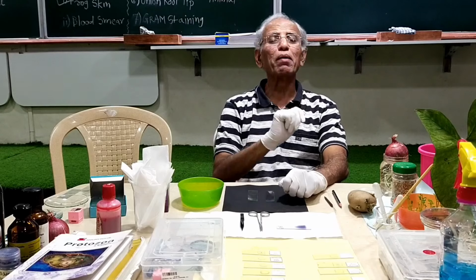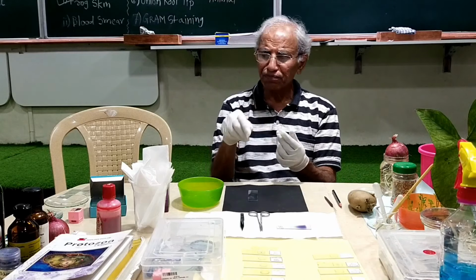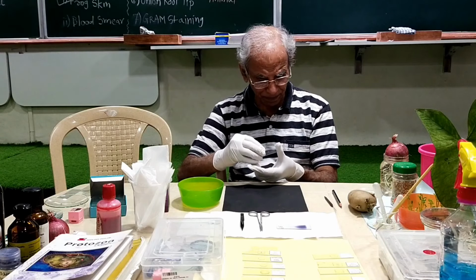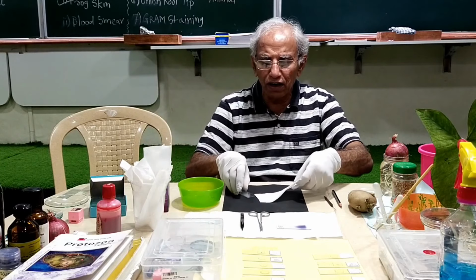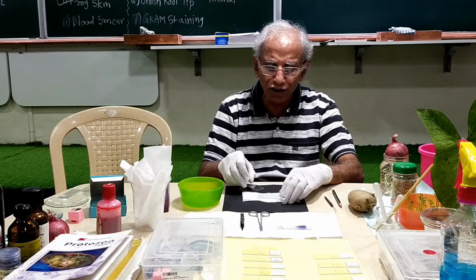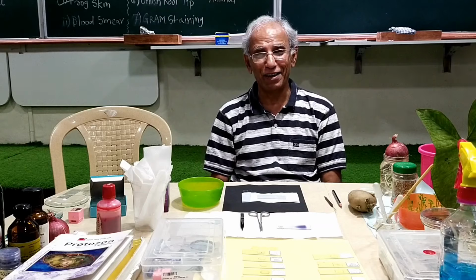We have to have a drop of blood first. So on a given slide, we will have a drop of blood, and with the second slide, I'm just going to spread the drop of blood. You may wonder whether it is really very difficult. To be very frank, it is not difficult at all. It's quite easy, provided a drop of blood is available.